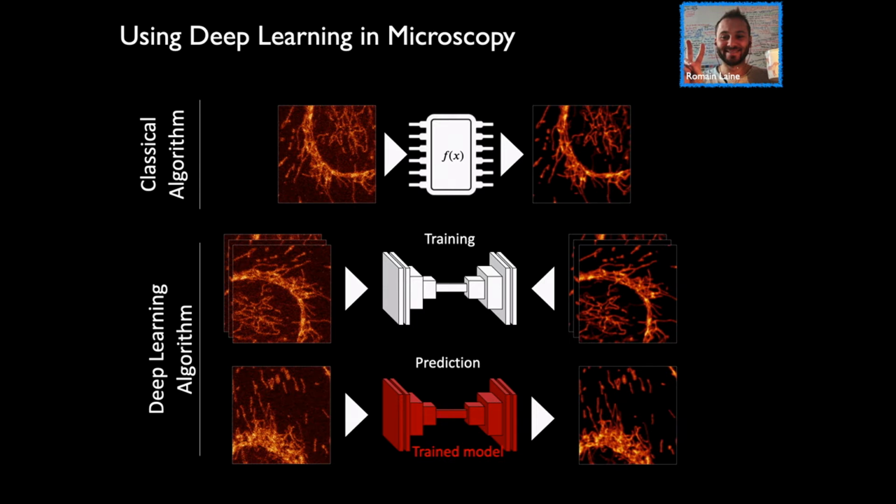So that means that the same type of neural network, if I gave it a non-annotated image and an annotated image, would try to its best capacity to learn how to annotate its image. If I showed it a low-resolution image on the left and a high-resolution image on the right, it would learn in its best capacity to make a prediction on how to improve resolution on images.